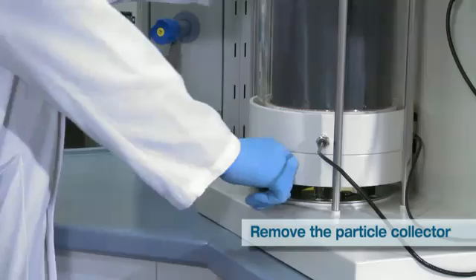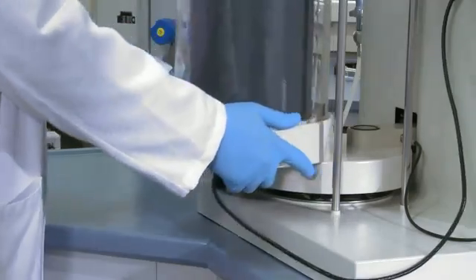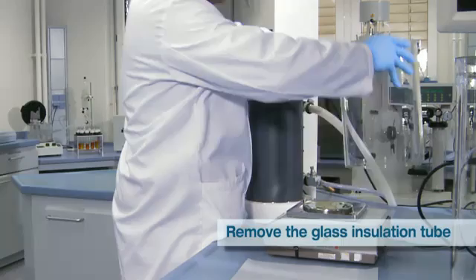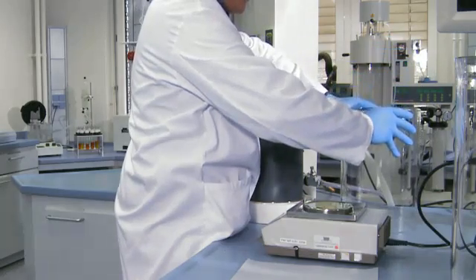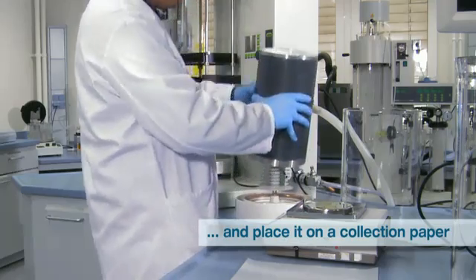To remove the particle collector, simply push the arm to the left and remove the insulation glass cylinder. Dismount the collection tube and place it on a piece of particle collection paper.